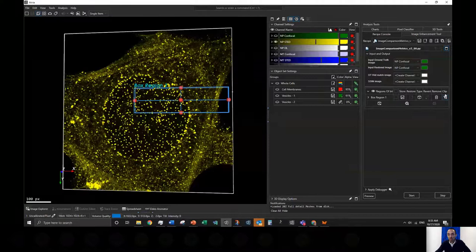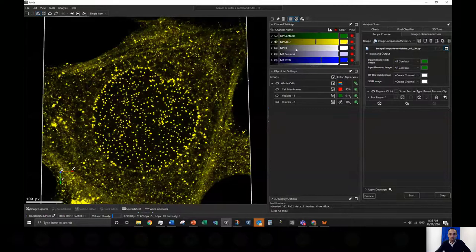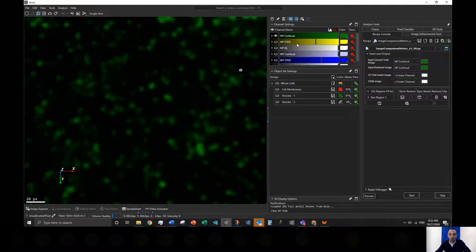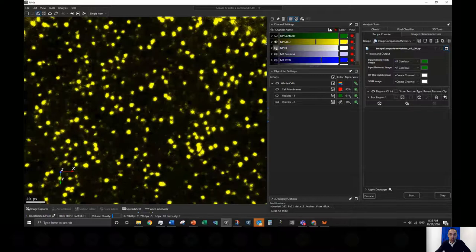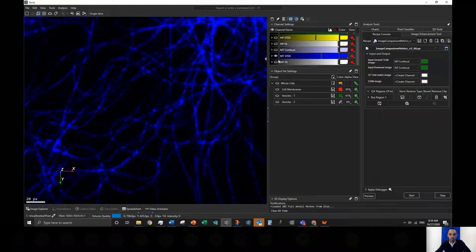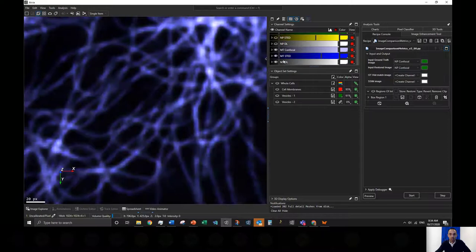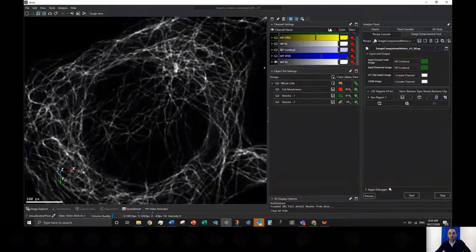Here is the STED dataset. This is confocal of just the nuclear pores, this is real STED, and this is the restoration we achieved. Placing all three together — confocal, real STED, and restoration — you can see that the agreement between the STED and the restored is very good. The same comparison for microtubules: confocal, STED, and restoration, which also agree closely.